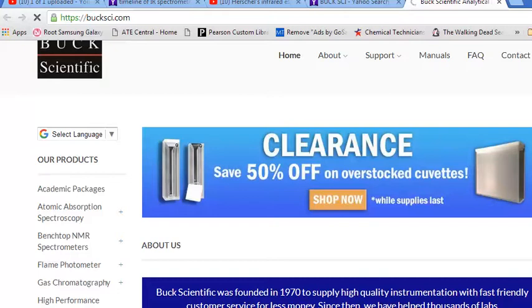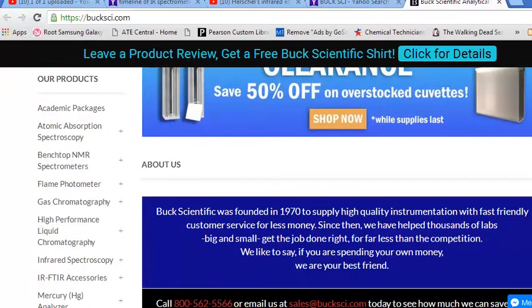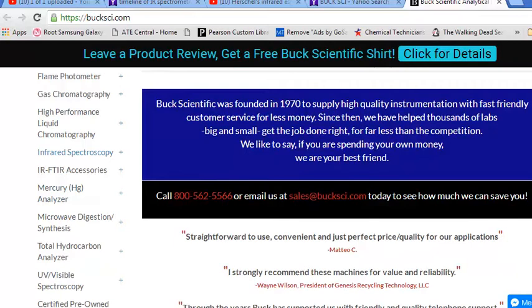So if I had a company and I wanted you to get trained on an infrared, I'm probably going to train you on something that can tear up, that we can fix pretty easily, and not our Lexus model or our Ferrari model, right? I'm going to give you kind of the run-of-the-mill infrared first. And that's what Buck Scientific is known for. So over here to the side, you'll see the different pieces of equipment that they offer. And chromatography will be coming up in a completely different course. But here you see infrared spectroscopy. All right.